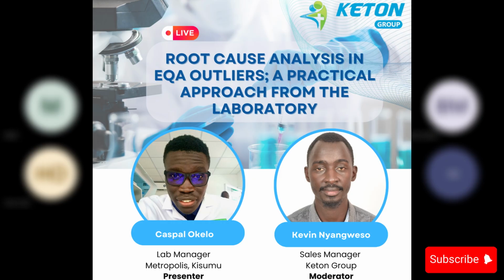Musumba is asking, what is the relation between corrective action and preventive action, and how are they used in NCRCA management?